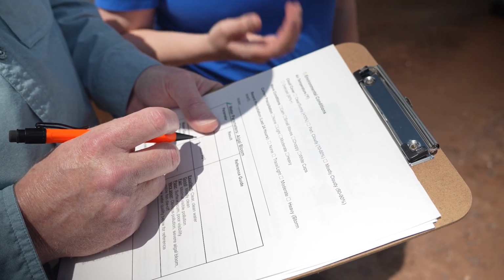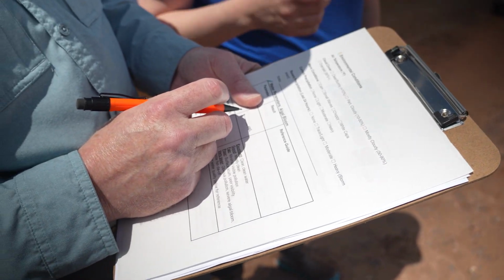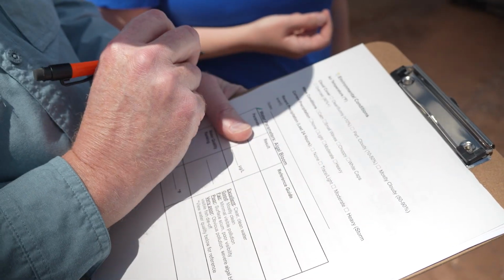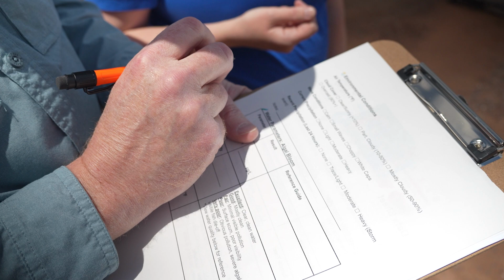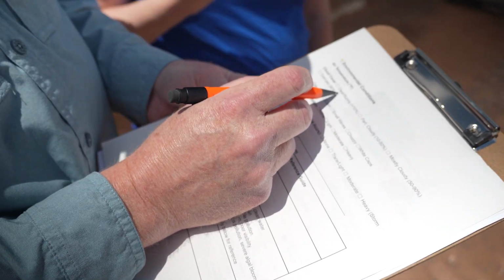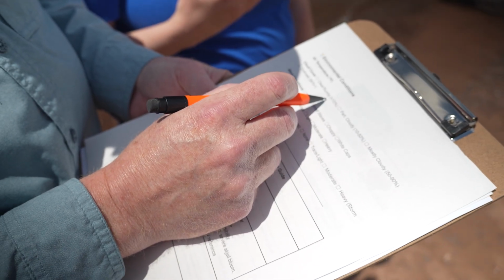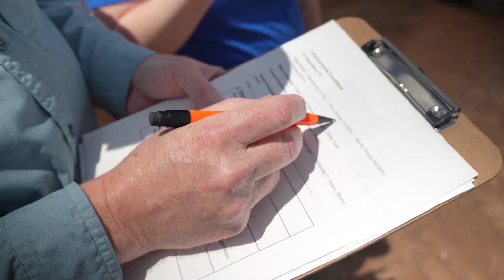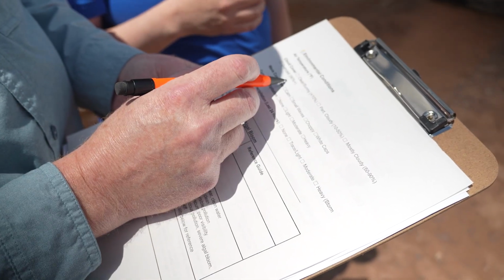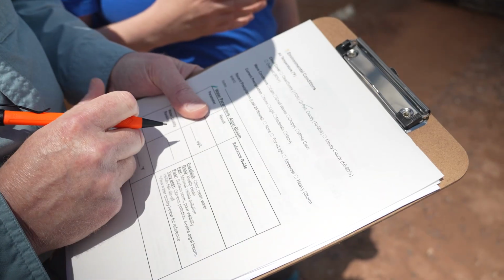Next, we're gonna look at environmental conditions. So what is it like out on the day and the time that you're sampling? So air temperature is gonna be the first thing we'll wanna record. You can just open your favorite weather app to get that temperature in degrees Fahrenheit. We also would like to know what the cloud cover is like. So is it clear and sunny like it is out today? If there's less than about 10% cloud cover, we'd say it's clear. Partly cloudy is gonna be that 10 to 50% cloud cover. Mostly cloudy, 50 to 90% cloud cover, and then overcast or raining is gonna be above 90% clouds.